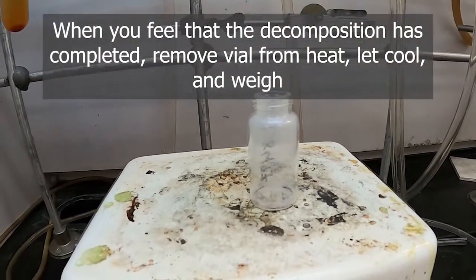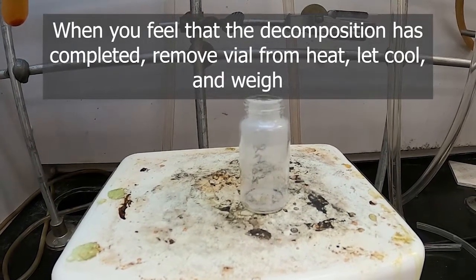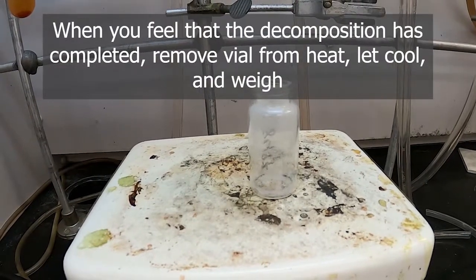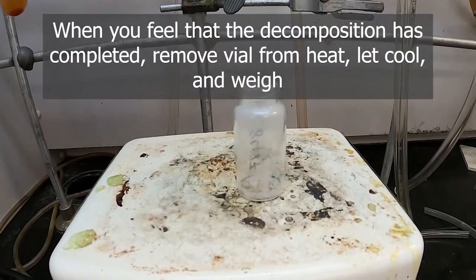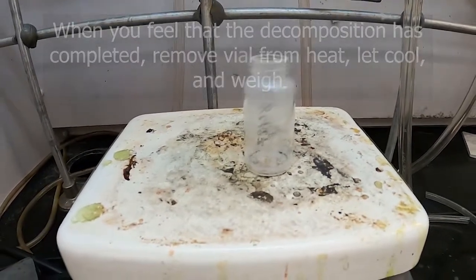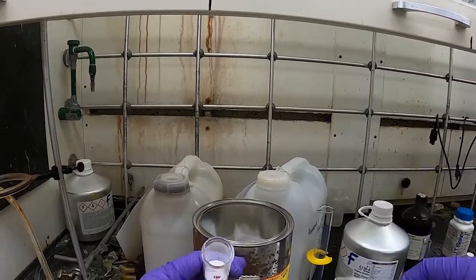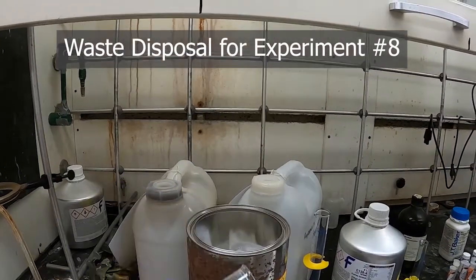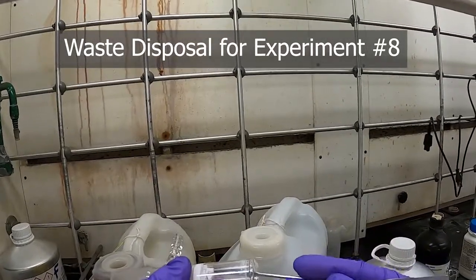So I can still see a little wisp of vapor coming off, but this is where I'm going to stop the heating. The amount of time that you heat your vial is of course going to be up to you. So good luck with the experiment. So I've got our funnel here with the solid remnants left in it. I'm going to dump those in the solid waste. Scrape them out of the funnel straight into the solid waste.